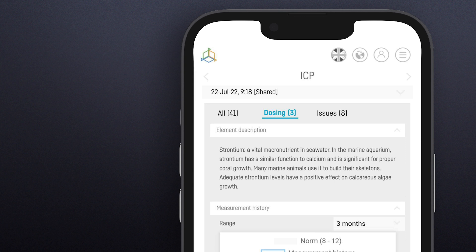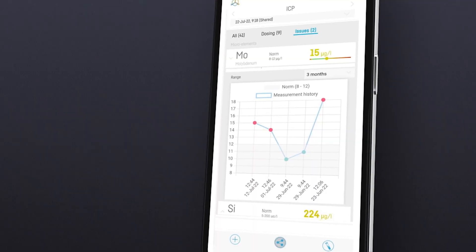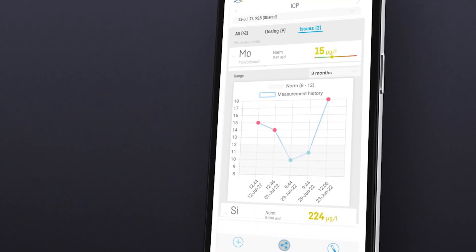Element description is short information about what a certain parameter is and what its main role is. Measurement history contains all the measurement logs presented on a scale.